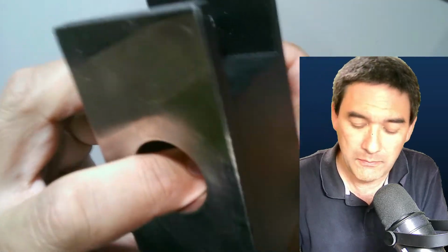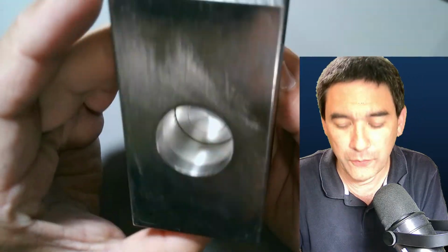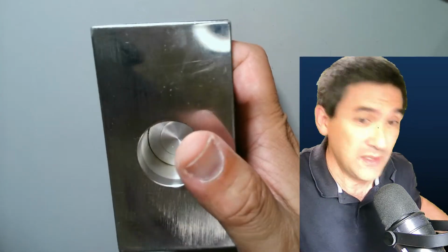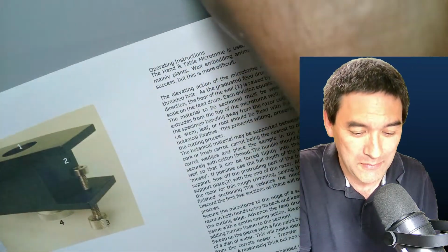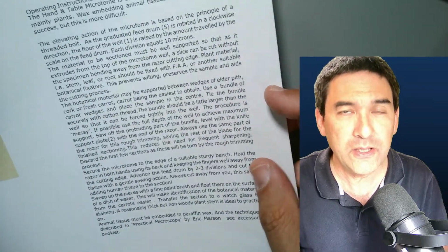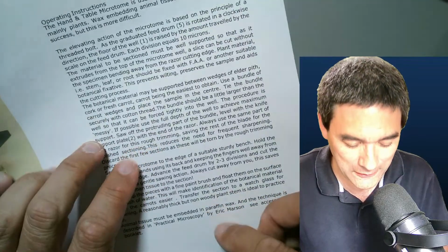I've been experimenting with this now for today, and it did also come with an instruction, and they actually sent it to me over email, so it's nice to have someone to talk to. This is what they sent me: a PDF with some instructions here. Very straightforward and direct instructions, and the important thing is that whatever you put in here should be squeezed in a little bit. I like the way that they've written it here.